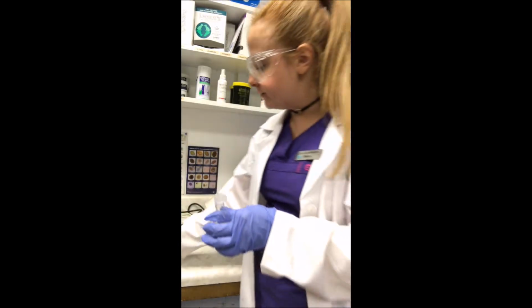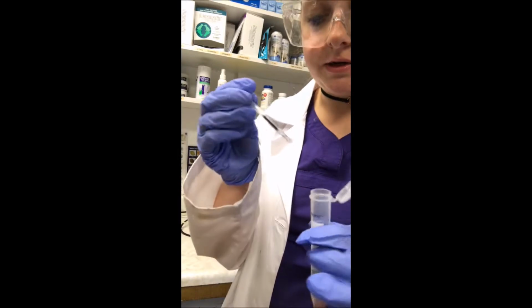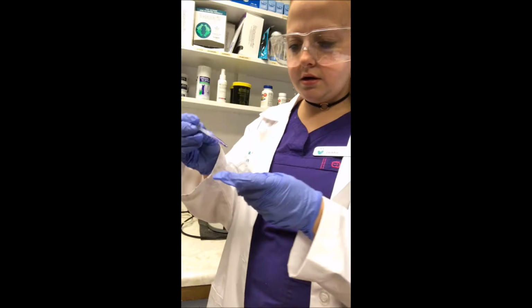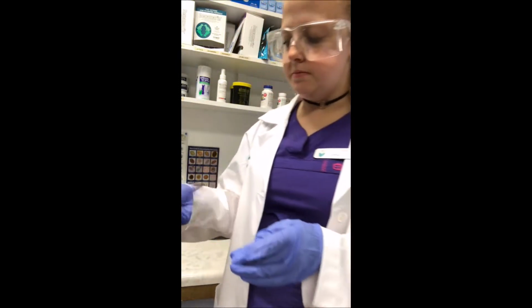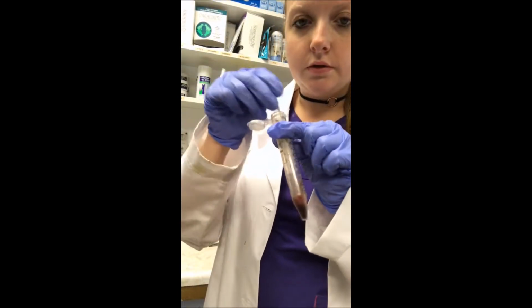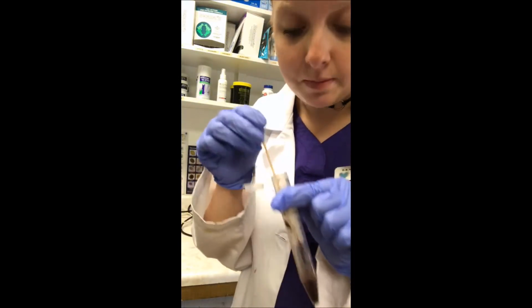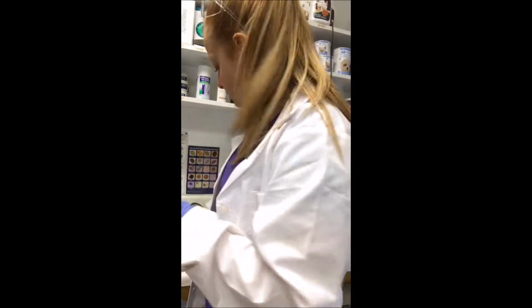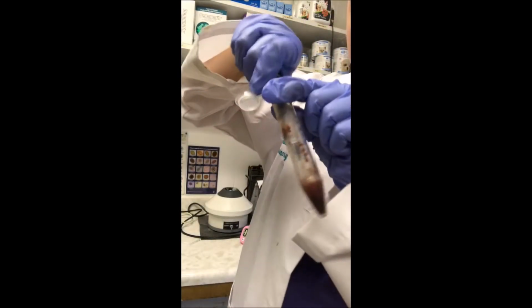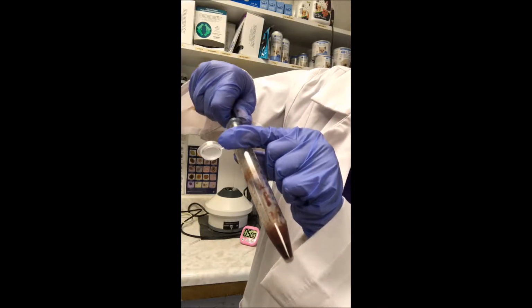Now we're just going to take a drop of new methylene blue that I just have in this bottle, and I put some in a pipette to make it just a little bit easier. I'm going to drop just a drop in there. Okay, I'm going to go ahead and mix this up. I'm just going to use the stick to stir this because I don't have a long pipette. So unfortunately, since I don't have a long pipette, I'm going to have to use a needle to pull this out. So I'm just going to use the syringe with a long needle and pull some of this up.